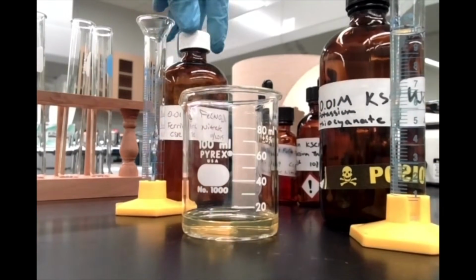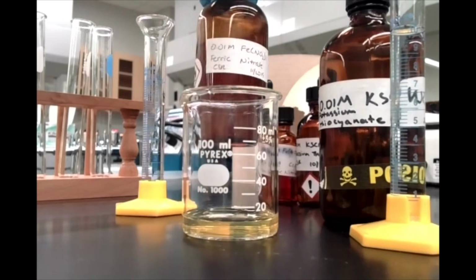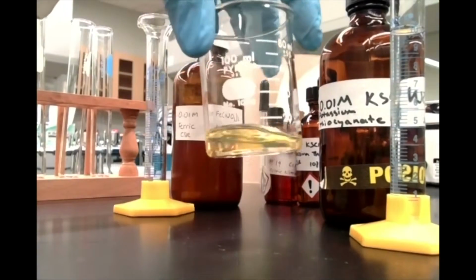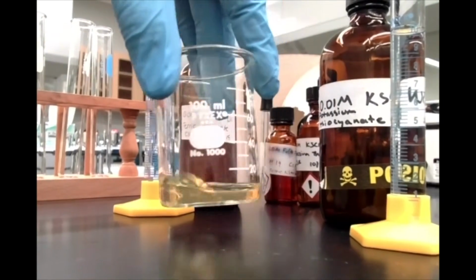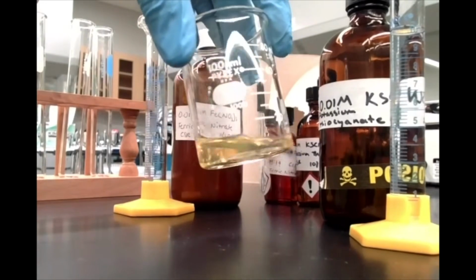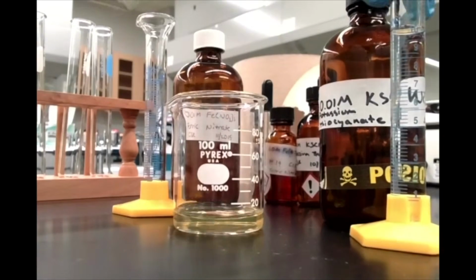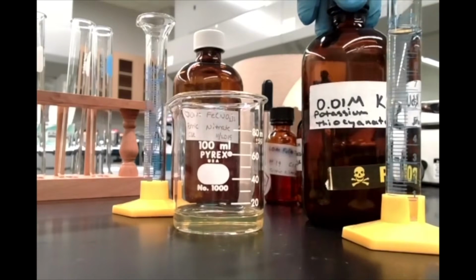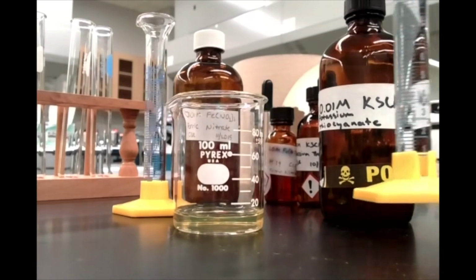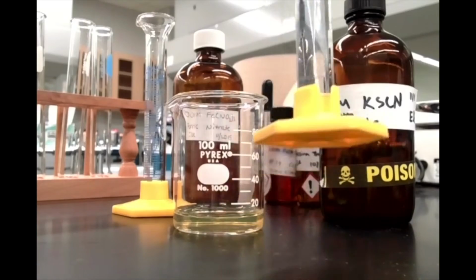All right, I've added 10 milliliters of 0.01 molar iron 3 nitrate. I measured 10 milliliters in a graduated cylinder and already poured it into this beaker here. You can see it's this kind of yellowish solution. You may recognize it from a couple of labs ago. Over here, I've measured out 10 milliliters of 0.01 molar potassium thiocyanate. Again, notice it's a clear, colorless solution. There we go. That should make it a little bit easier to see that color.